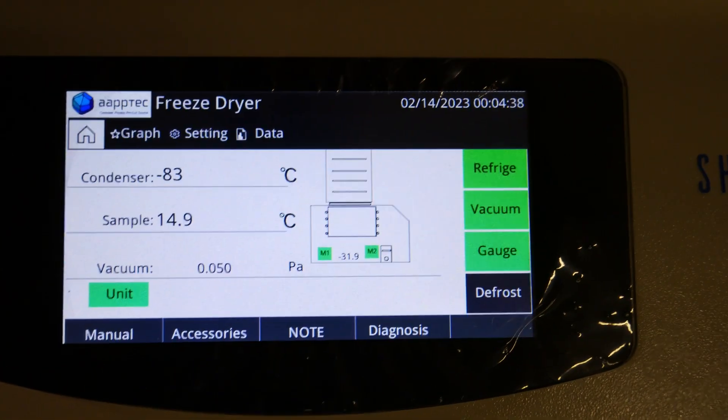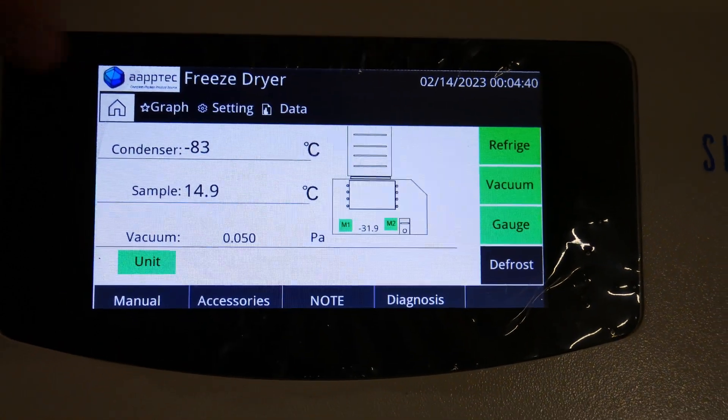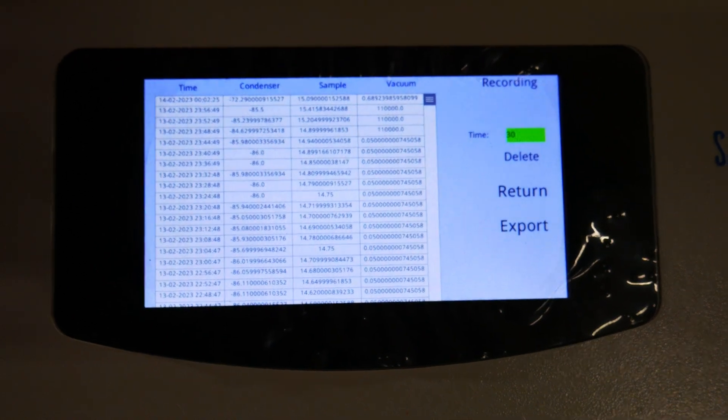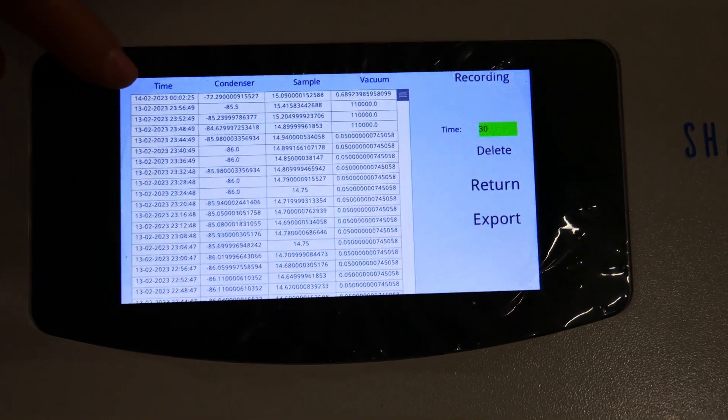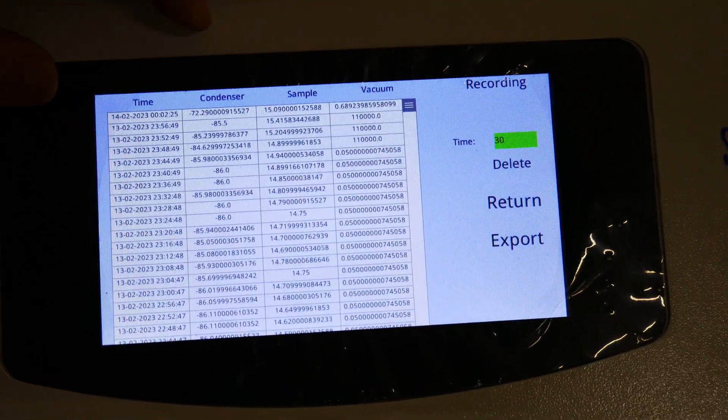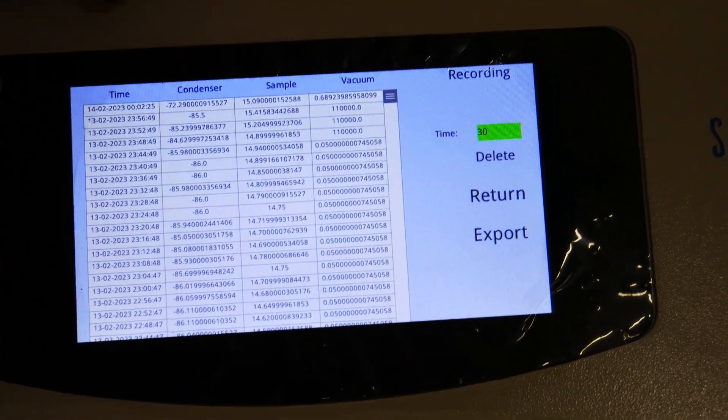Now, we come to the data. By pressing data, it shows you how the system has been working. It shows you the vacuum, the time, the temperature of the compressor, the temperature of the sample, and how the vacuum worked. So you have data to show you when and how the system changed over time.